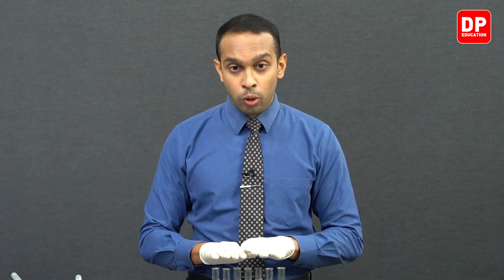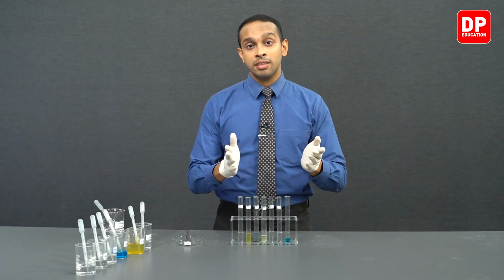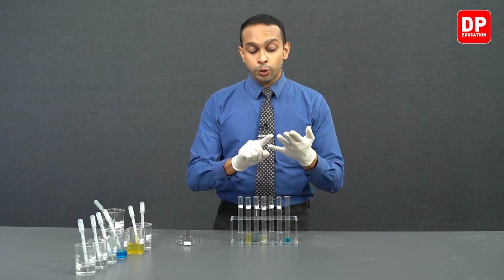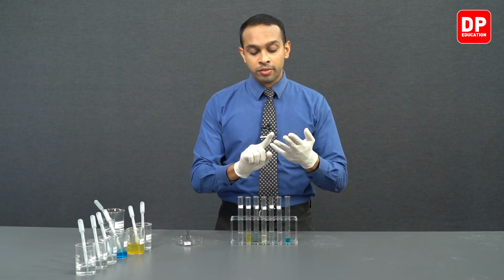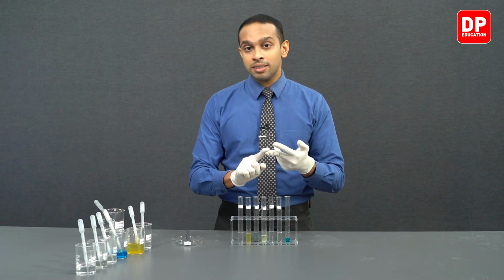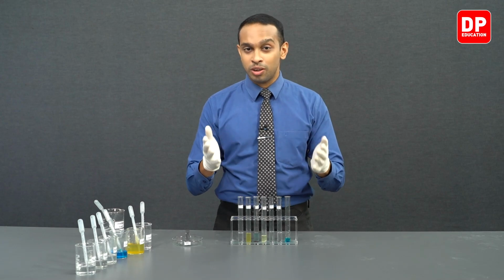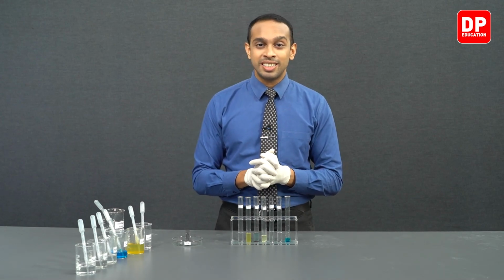However, when it comes to all the other metal solutions, they did not show a reaction with iron solid. So this indicates iron is less reactive than sodium, iron is less reactive than magnesium, iron is less reactive than zinc, and when it comes to Fe2 plus ions, Fe2 plus ions will not get displaced by iron itself.